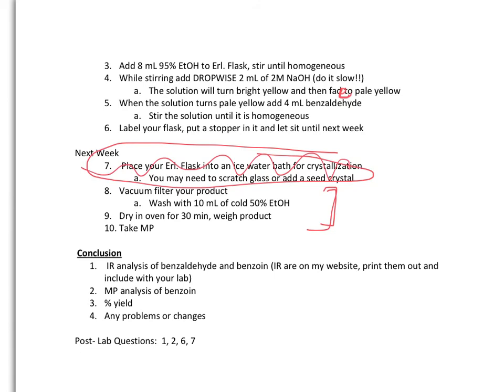We will wash it with cold ethanol, and we will set it for drying for about 30 minutes, and we'll take the melting point. So during that 30-minute period, we are going to go over the next chapter, carboxylic acid, wherever we would have stopped. We are going to continue our discussion there. So after everybody has set up, we are going to continue our discussion, and then we'll do the same oxidation reaction that we ran last week, which was based on aldaric acid.